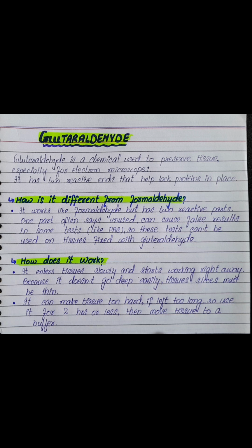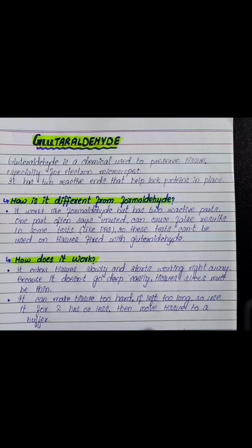So, as we know, that is a huge topic, but in this video lecture I just briefly cover some important points so that we can understand and remember all the points easily. So the first is, what is gluteraldehyde? Basically it's a chemical that is used to preserve the tissue as the other fixatives do, especially for what? Electron microscopy. As the name suggests, it has an aldehyde group, so it has two reactive ends that help lock proteins in place.